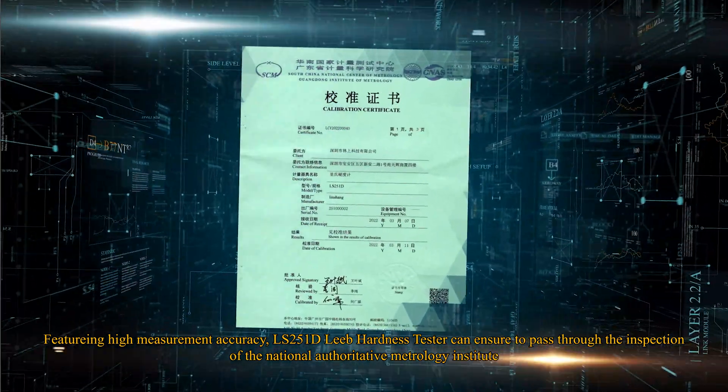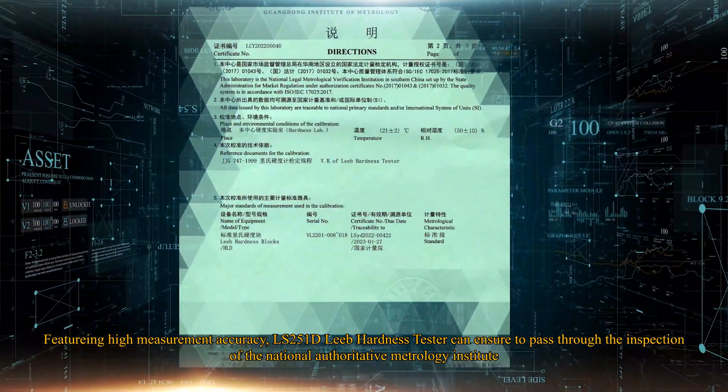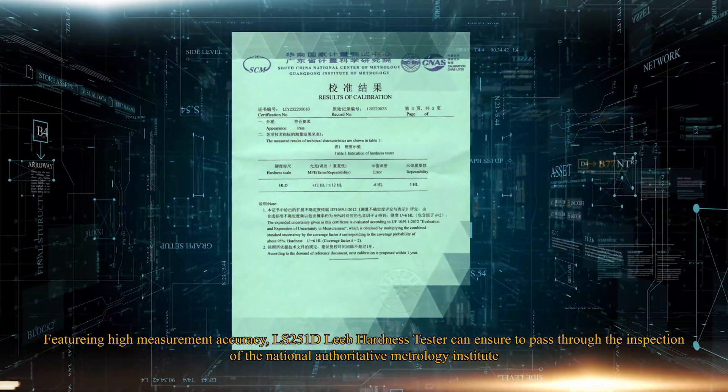Featuring high measurement accuracy, the LS251D Leeb Hardness Tester is certified to pass the inspection of the National Authoritative Metrology Institute.